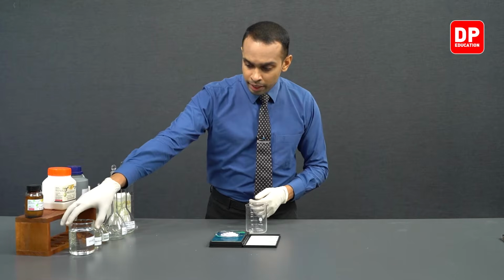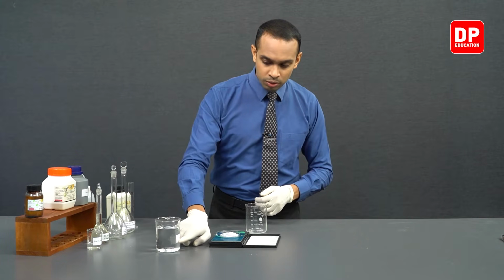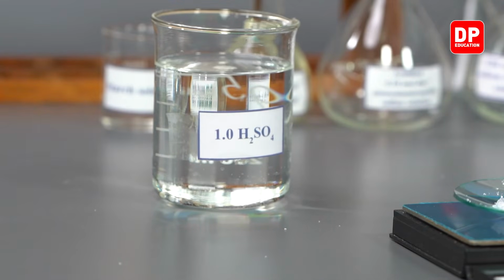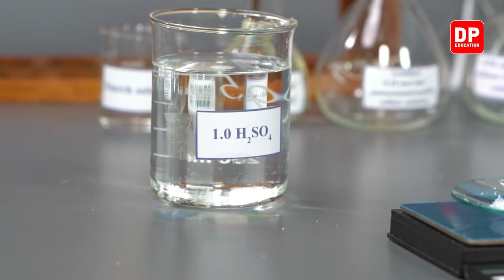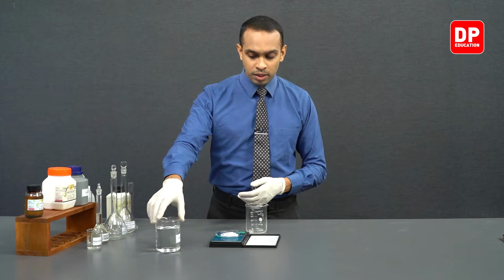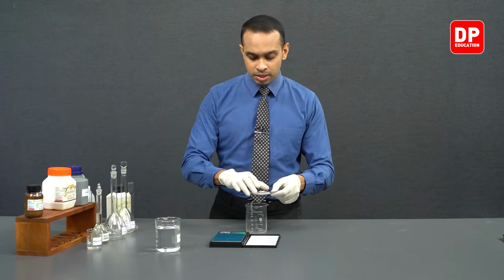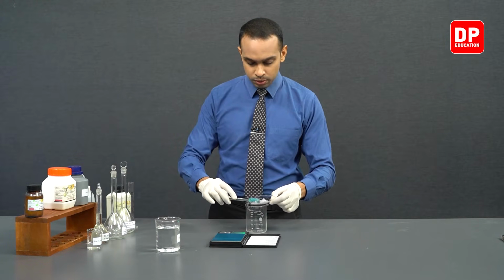So like I mentioned earlier, we cannot use water, so we'll be using 1.0 mole per decimeter cubed sulfuric acid solution. So this is 1.0 mole per decimeter cubed sulfuric acid that we have over here, and we'll be transferring first this solid into a beaker like so.